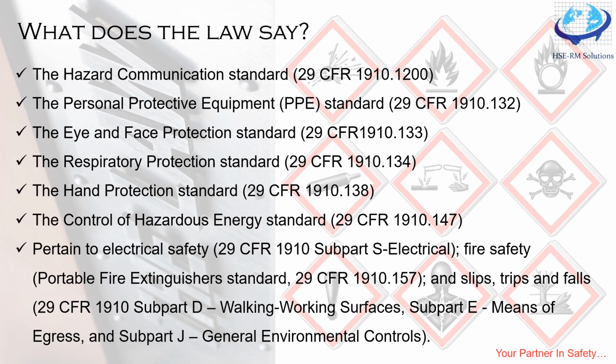Later, you must communicate through the risk number. Higher the number, higher the risk. Finally, how to control the exposure, and the equipment or procedure you must keep while handling the chemical. And last but not the least, you must know how to store it and how to handle emergencies related to that chemical. So in simple 4 to 5 steps, or common columns, you can define the communication system.